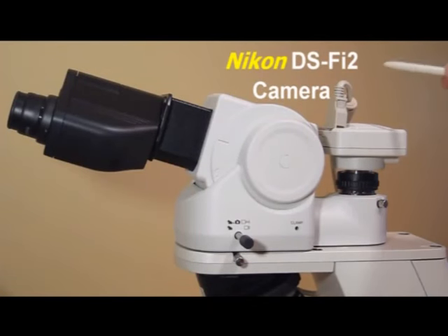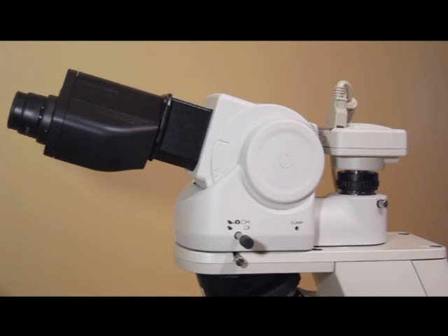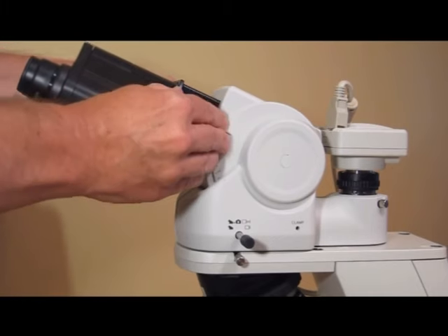The new Nikon DigitalSight DS-Fi2 camera can be attached to any microscope with a C-mount adapter. The Nikon ergonomic body tube tilts, telescopes, and has a port for photography.